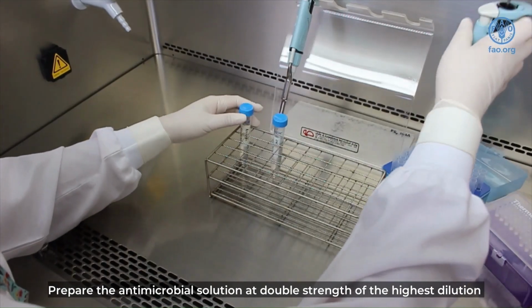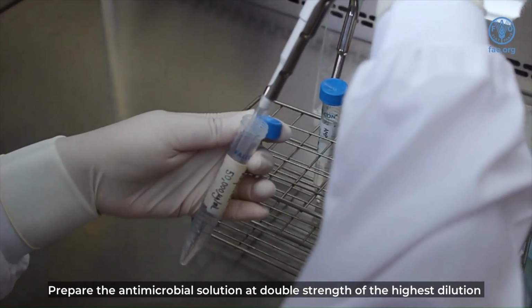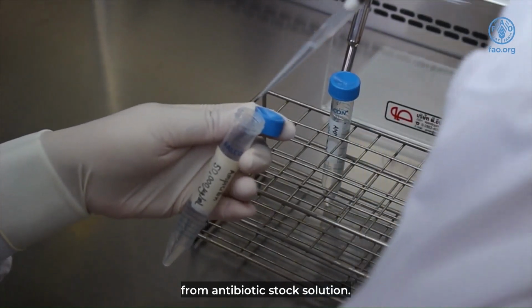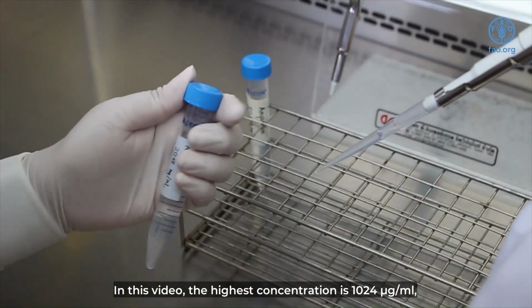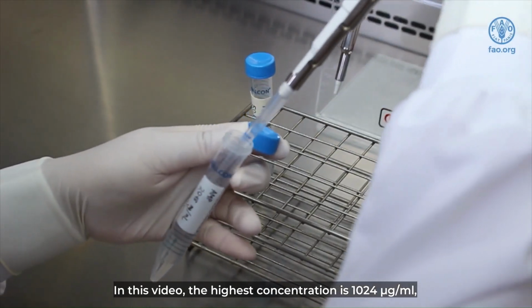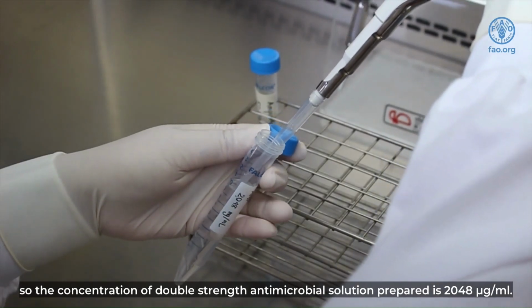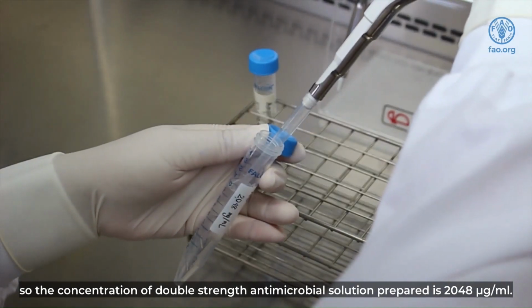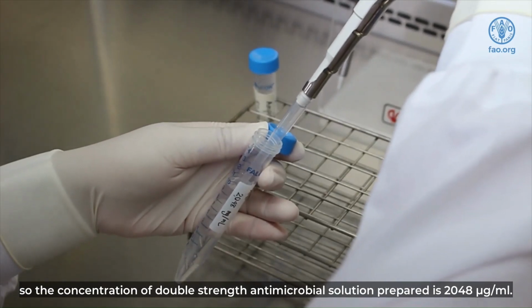Prepare the antimicrobial solution at double strength of the highest dilution from antibiotic stock solution. Here the highest concentration is 1024 micrograms per milliliter, so the concentration of double-strength antimicrobial solution prepared is 2048 micrograms per milliliter.